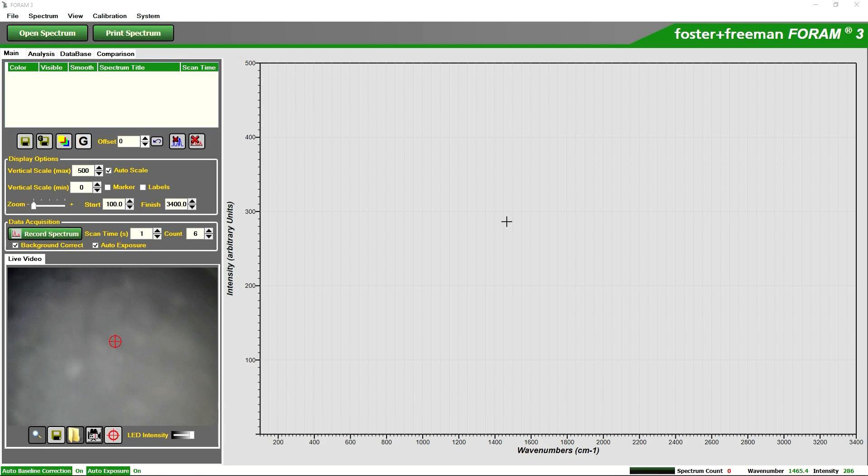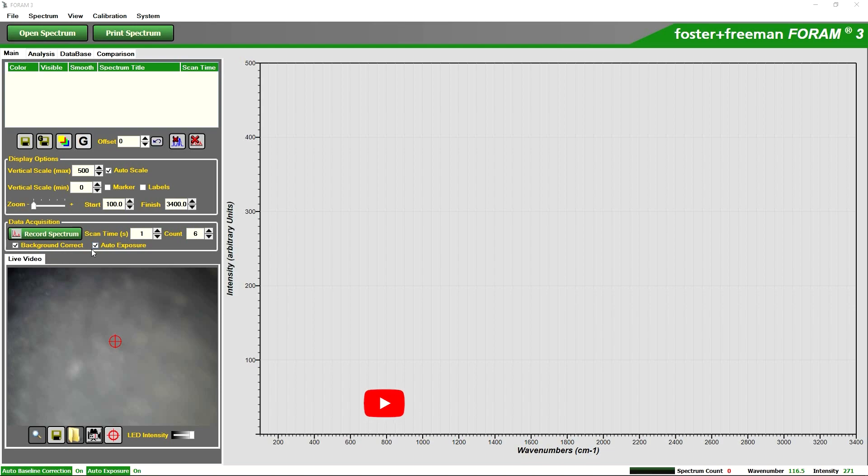For our controls the main setting that we will choose is the number of counts, so a higher number of counts will improve our signal to noise ratio. Auto exposure is where the FORAM will determine the optimum scan time or how long we are acquiring a signal for.